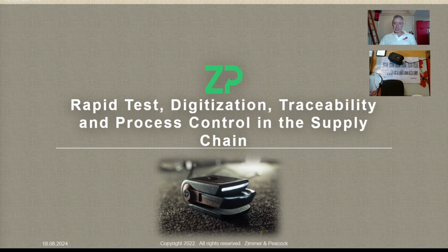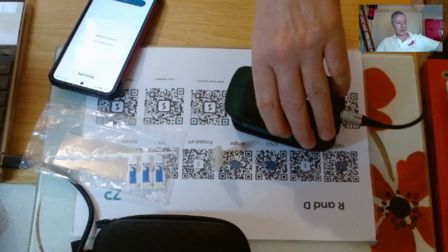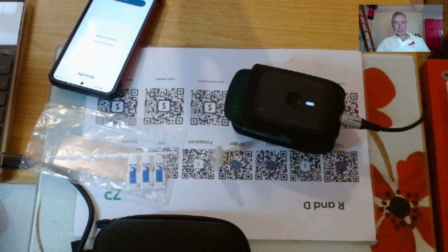Hi, welcome to this special video, and it's really about the chemistry calculations behind Scoville Heat Units. Now, when I say that, I've actually got the Food Sense Generation 4 in front of me. I'll be using a quick demonstration of this, and the way we've got it configured at the moment, it's giving the results in Scoville Heat Units.